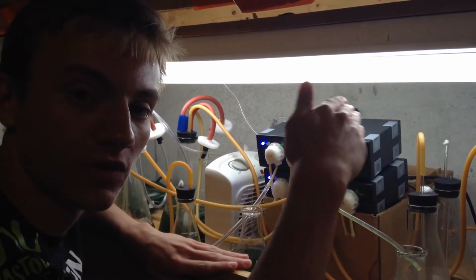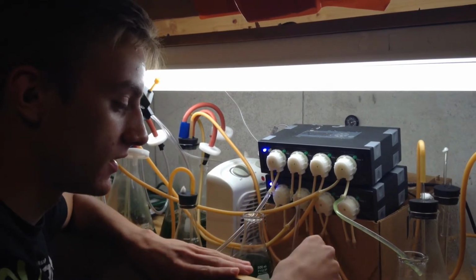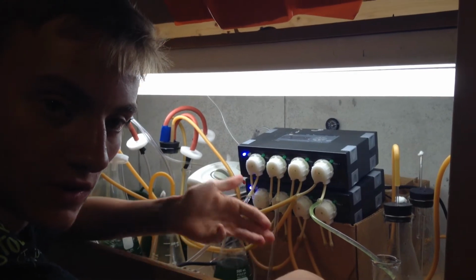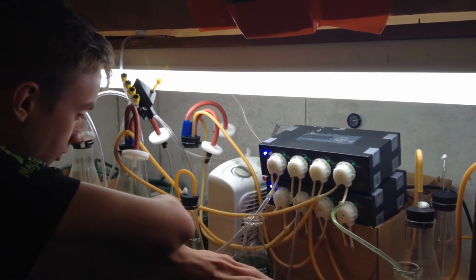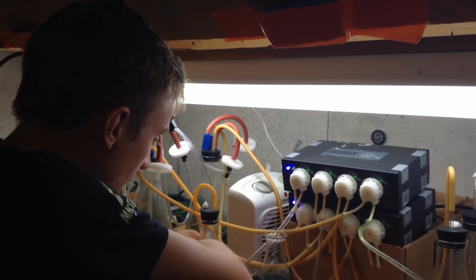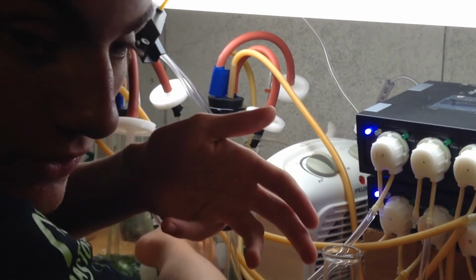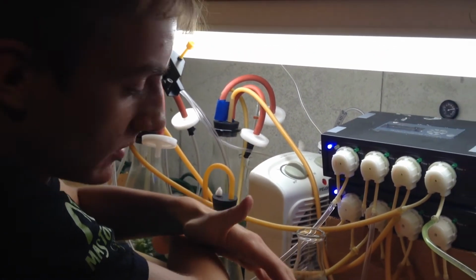And if I increase the dilution rate, so if I put in more and take out more, then that actually decreases the limitation of whatever nutrient I'm using. So in these cultures, nitrogen is the limiting nutrient, and as you can see, they're very dense. So the dilution rate, once I start it, I'll start at a very low dilution rate, and that would mean a very high nitrogen limitation.